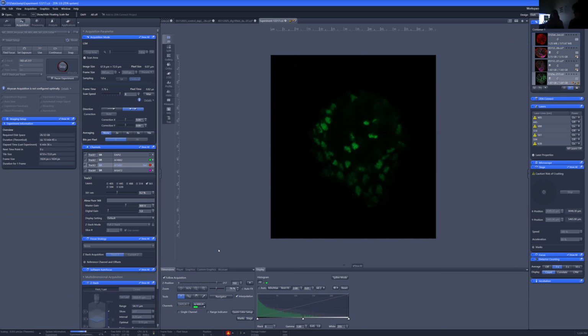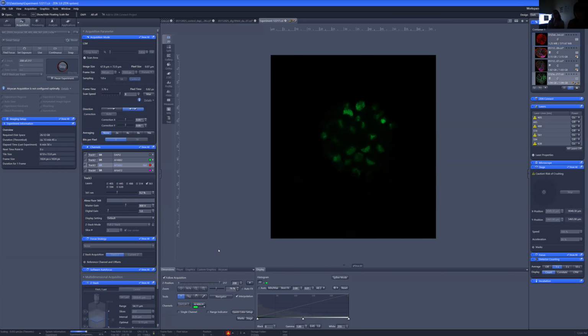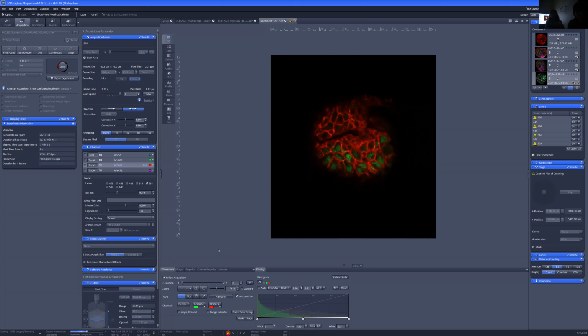So the reason it looked like it wasn't aligned in some of the slices is that sometimes, if you move too fast, the software will show you one slice of the DNA and a different slice of the green signal. It was just having trouble giving me what I wanted that quickly. And so yeah, I've given myself many little heart attacks and then realized you just have to slow down and let the computer work.